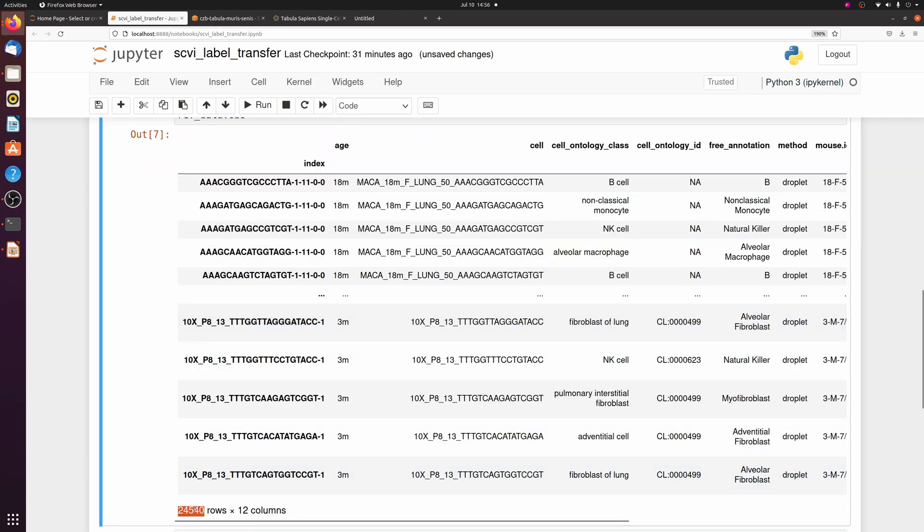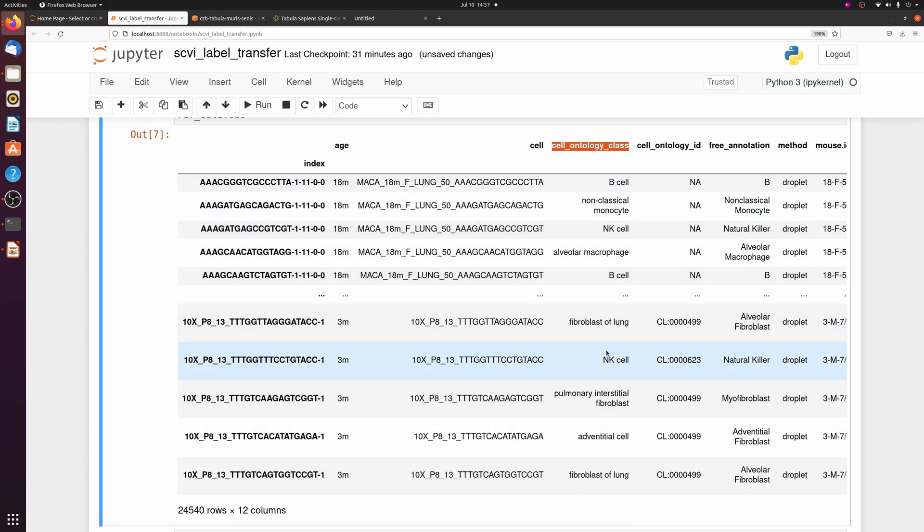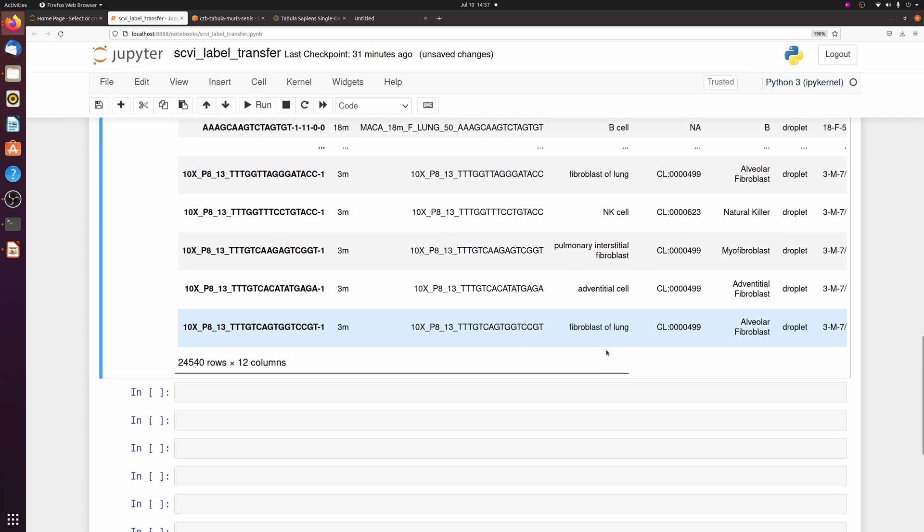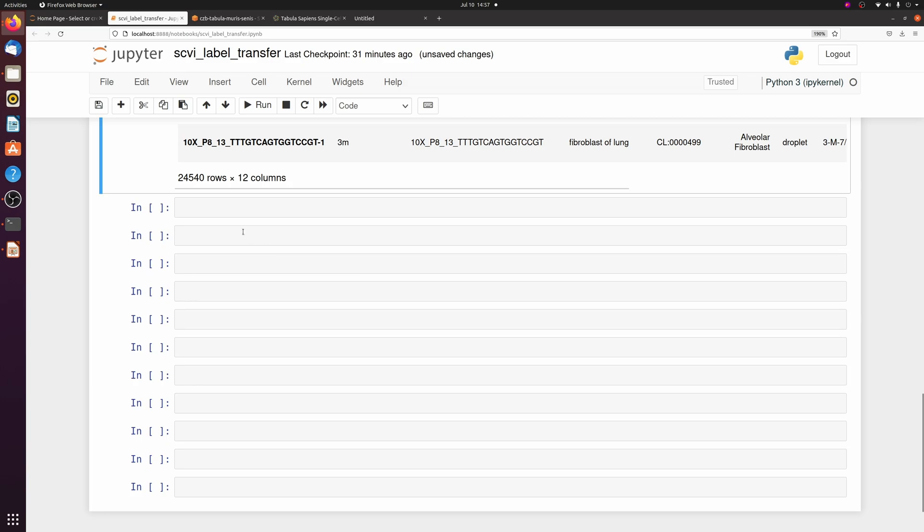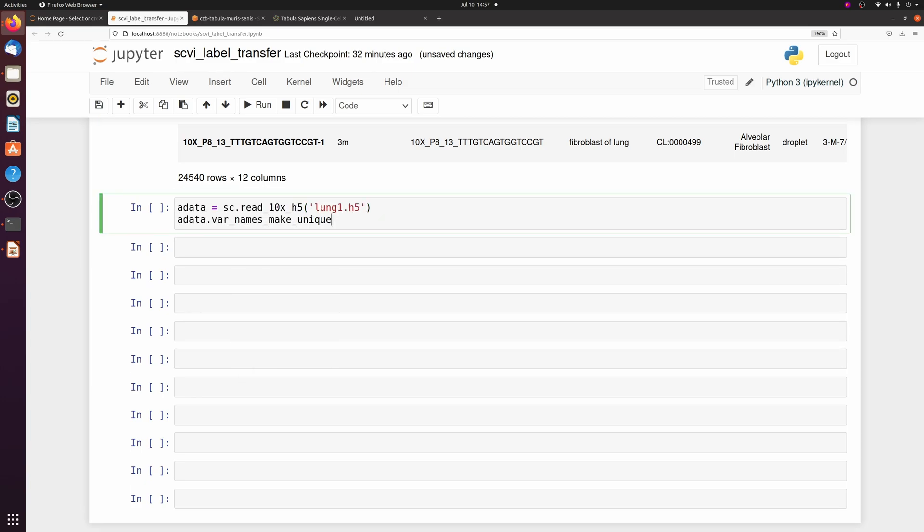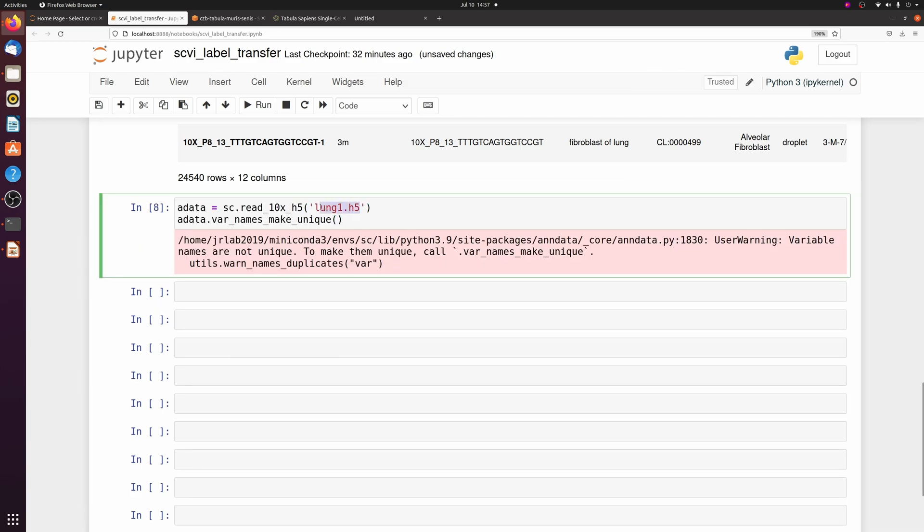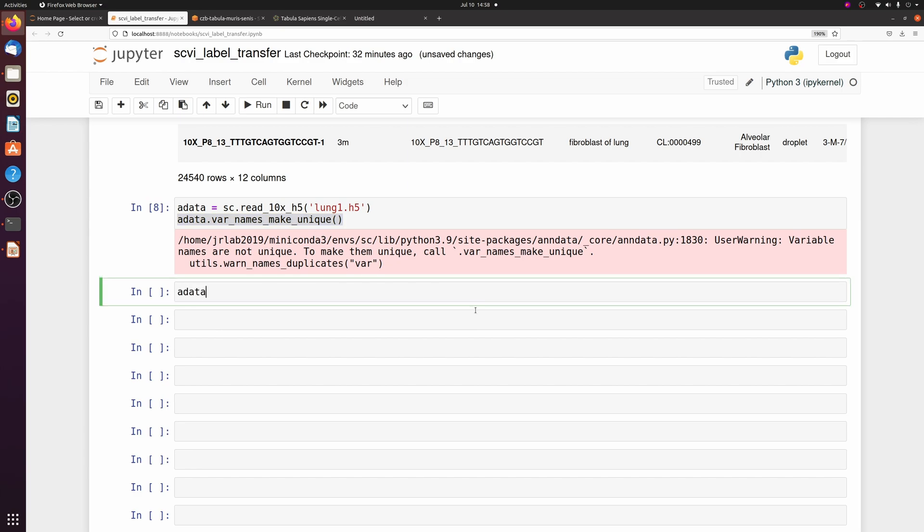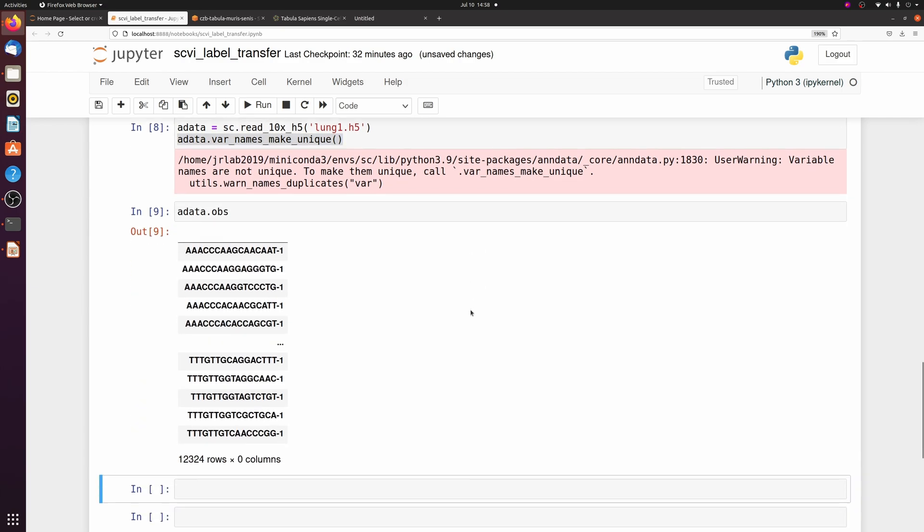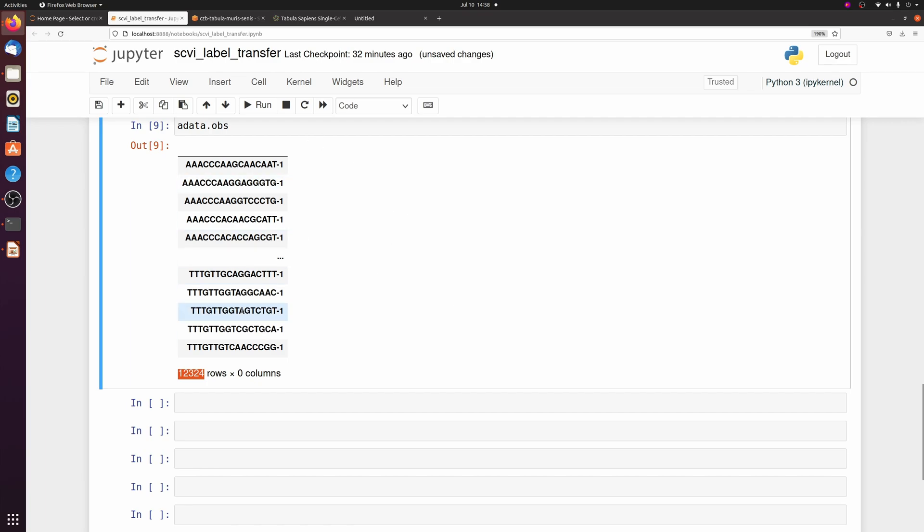Alright, now we have 25,000 lung cells with multiple different cell types. Next, let's load in our sample data. I just have one sample called lung one, and I'm reading the 10x h5 directly, which requires that you need to pass bar names make unique. So I have 12,000 cells in that sample and you see there's no labeling or anything.